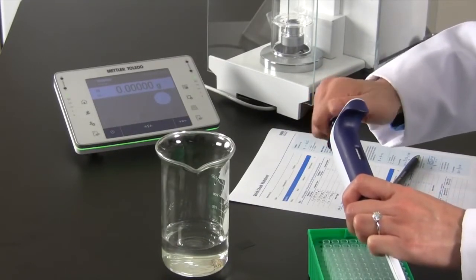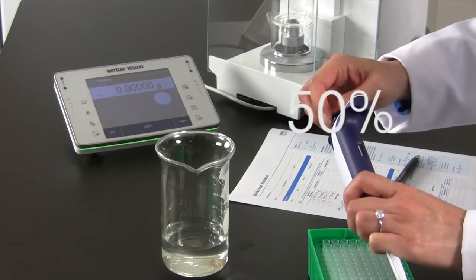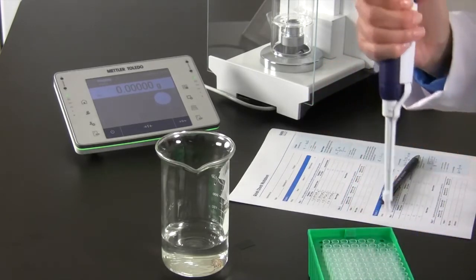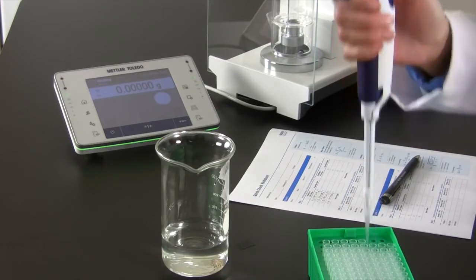Next, adjust the pipette down to 50% of its nominal volume. Pre-rinse a new tip three times, and take and record four more weighings.